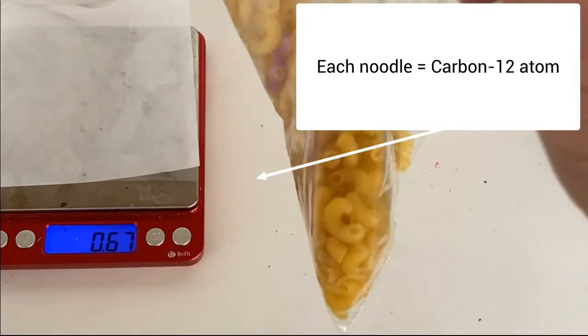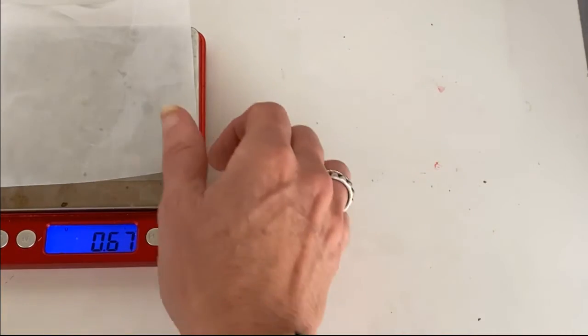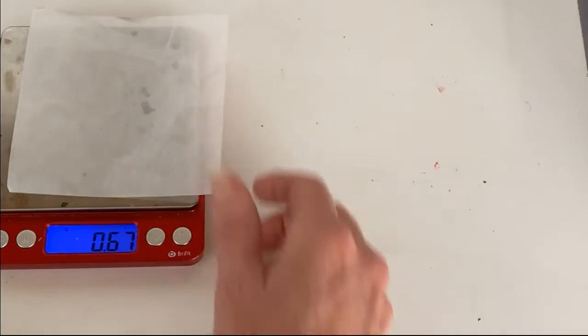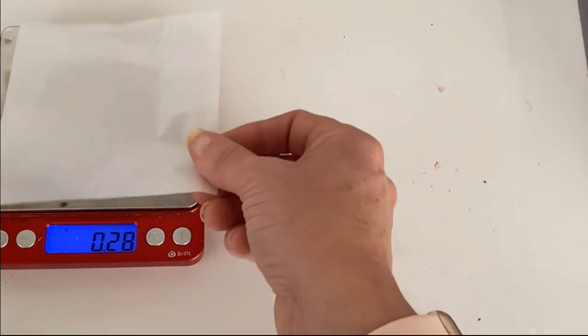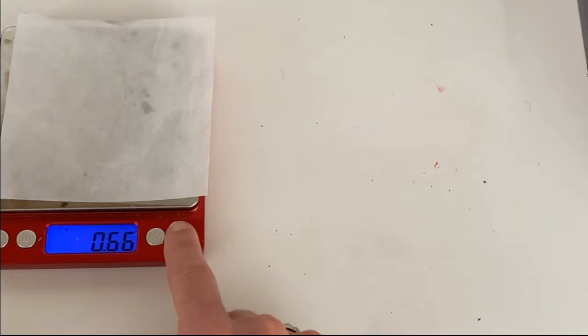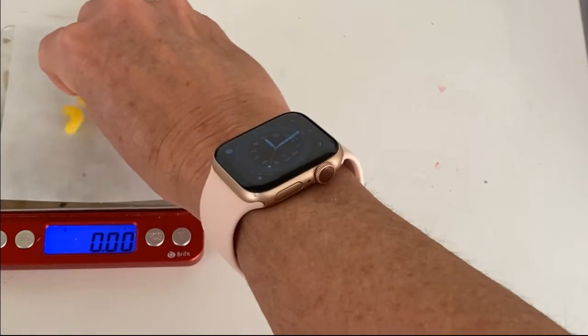You can count them all if you want or you can use some proportional reasoning. So to do that you're going to take the electronic balance. You're going to zero out the weighing paper and you're just going to put a few on the balance.